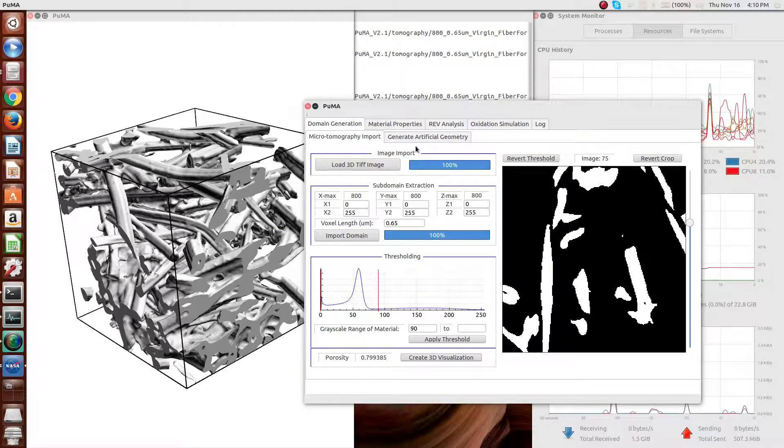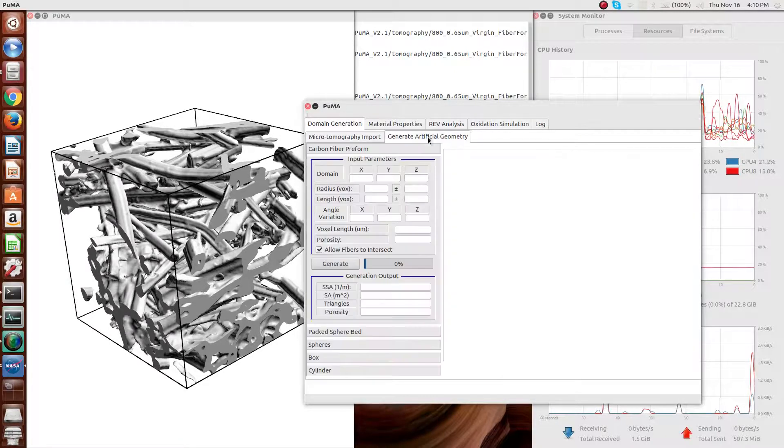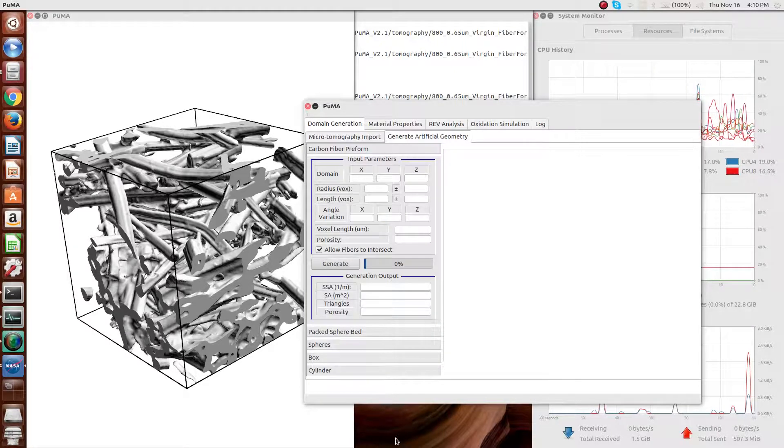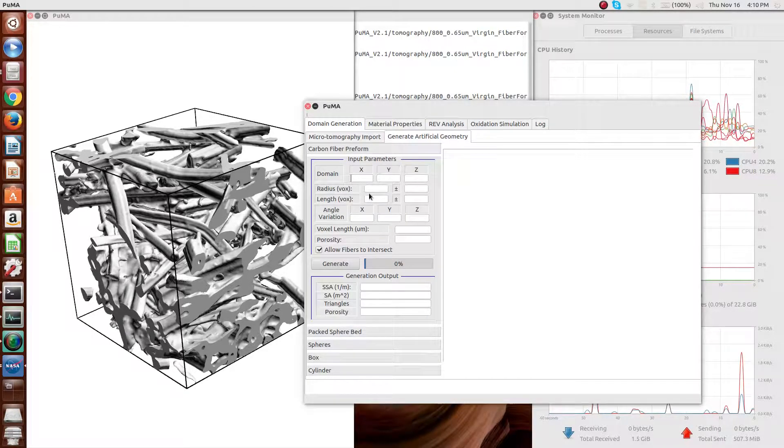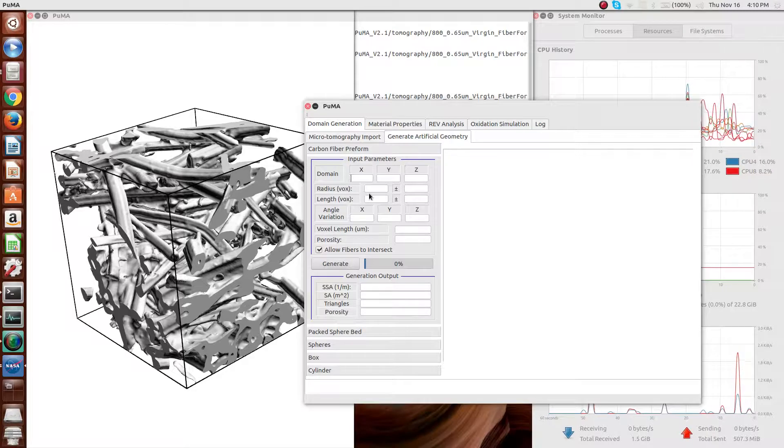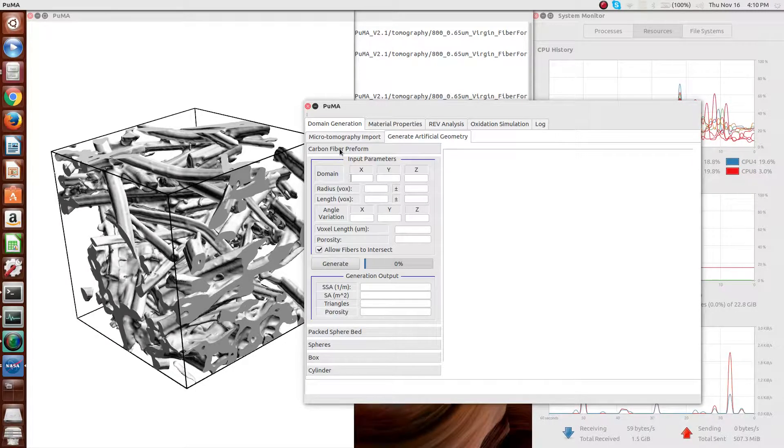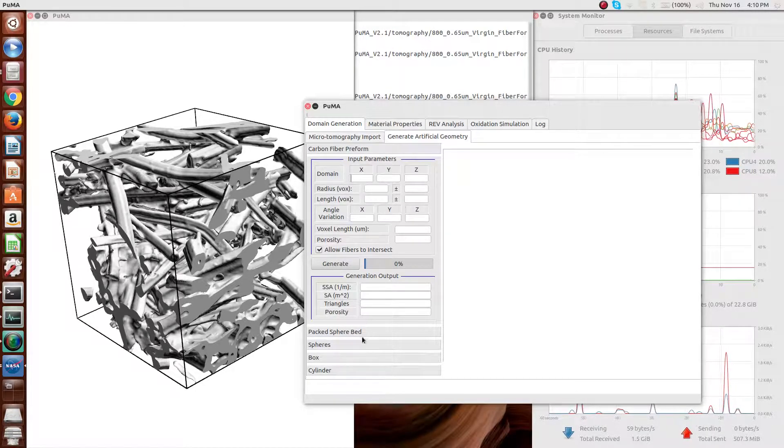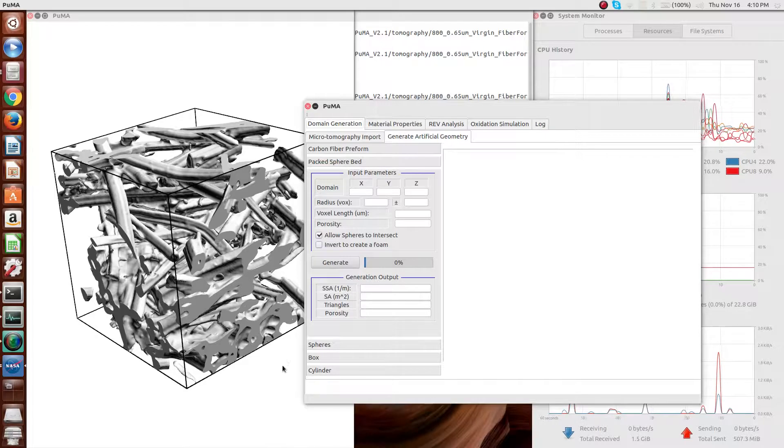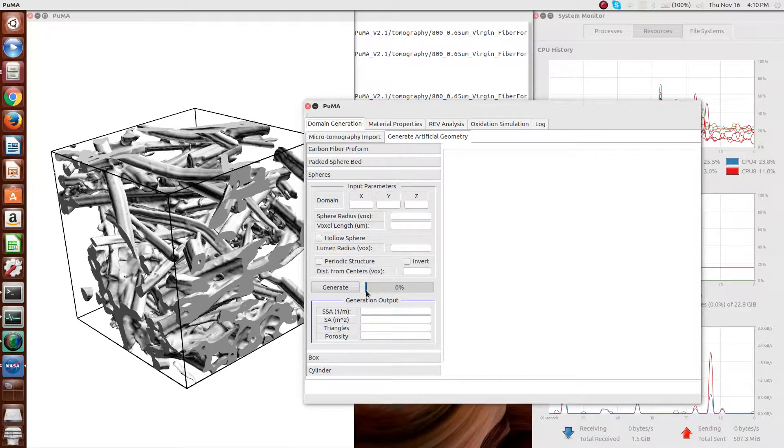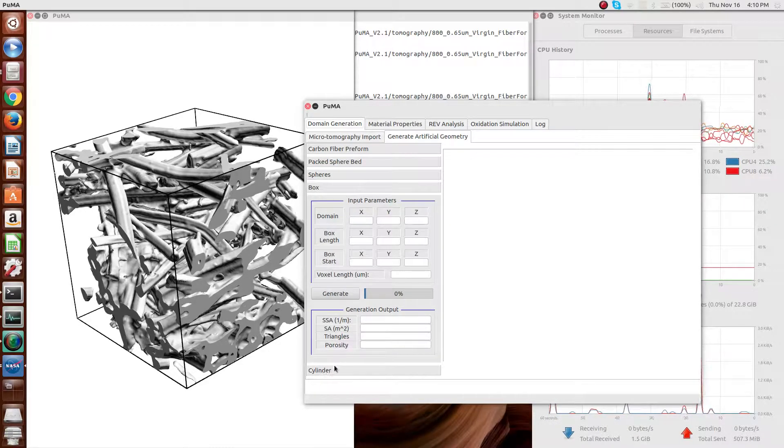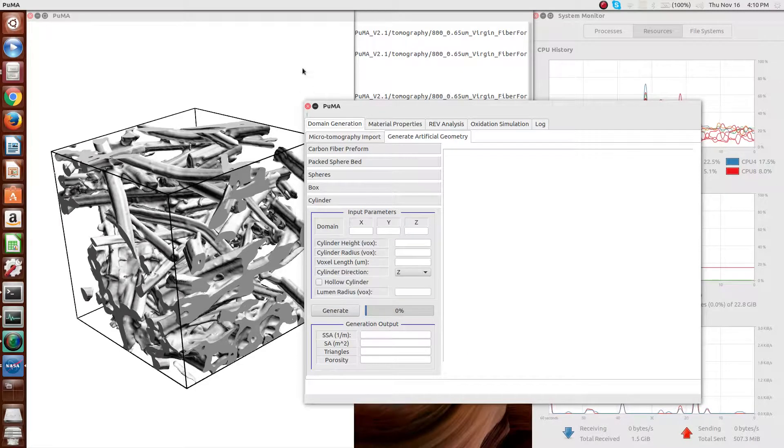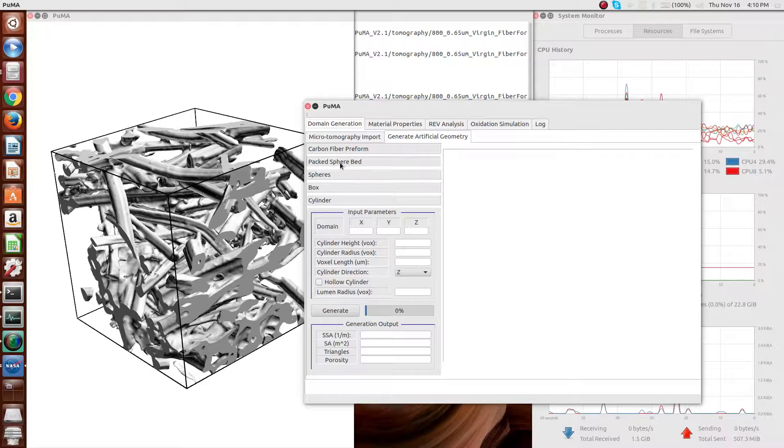Now, instead of importing the microtomography, you can also generate a variety of artificial materials. One option is artificial carbon fiber preform. Another is a packed sphere bed. Another is a simple sphere or periodic sphere structure, and then a simple box and cylinder. The bottom three are used pretty much entirely for verification purposes.